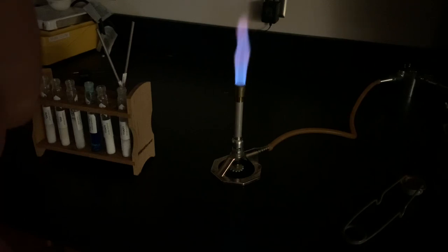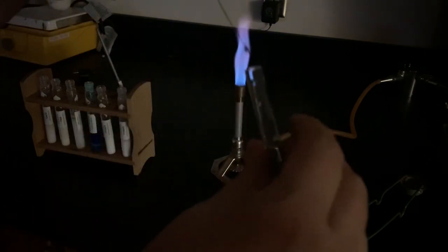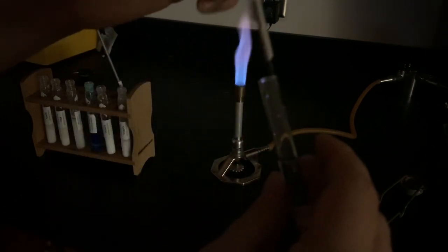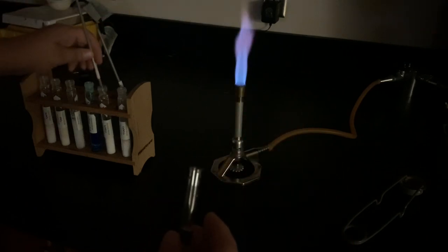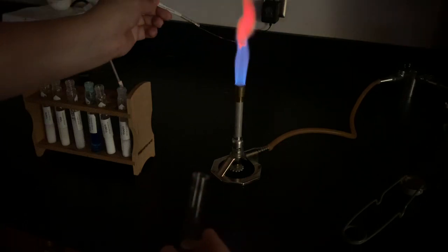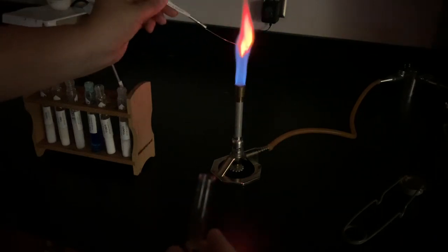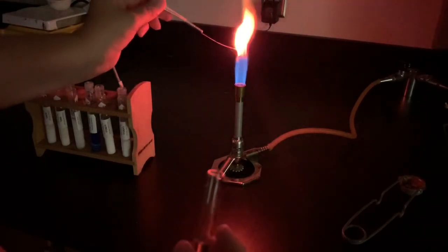Again clean water and clean inoculating loop as I switch to the next one. This one is strontium nitrate. I dip my clean loop into the clean water and then into my strontium nitrate salt. Strontium is also red, but a much lighter red than the lithium was.